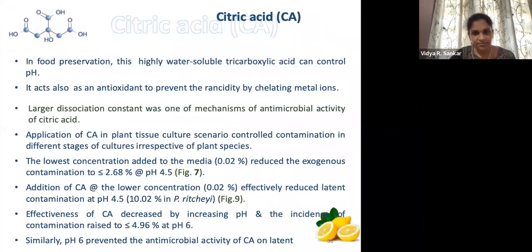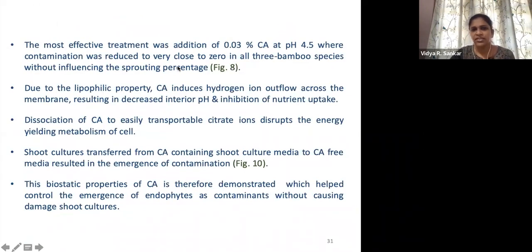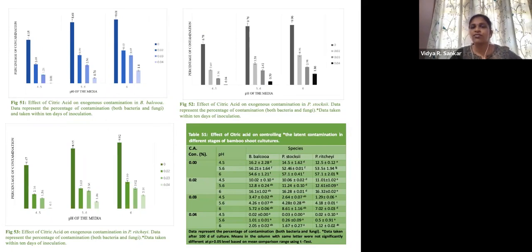Citric acid is one of the naturally occurring organic acids. We get very good contamination control at pH 4.5. A percentage of 0.02% is required for controlling exogenous as well as endogenous contamination. When enhancing the pH to the standard level of 5.6 or 6, the effectiveness of citric acid is reduced and it shows no influence on exogenous or endophytic contamination at the higher pH level.